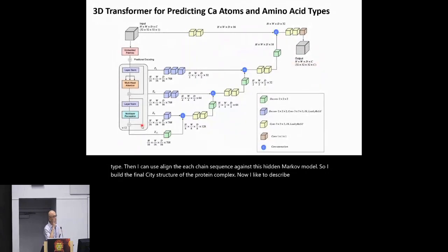First, how do you identify atoms and their amino acid types? Basically, we give a grid of the 3D density map containing the density values, only one single value for each voxel. I break them into 3D patches. Then those are put as input for a transformer with attention layers, multi-head attention, which generates the higher level features.